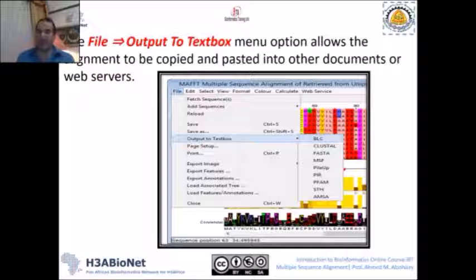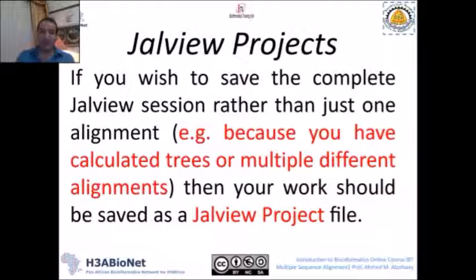So always keep in mind that if you would like to keep everything, try to save your file in Jalview as a Jalview project, so JVP. But if you would like to use it in another program, try to know the format required for that program, then save it in the required format as we showed you in the last slide.